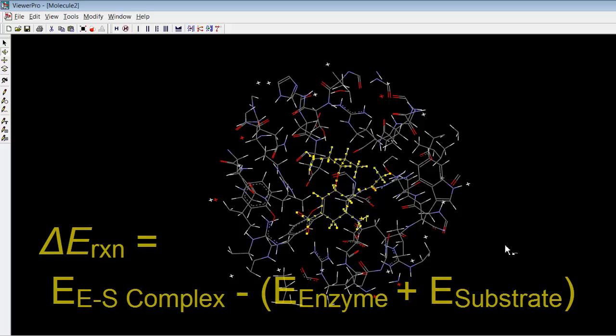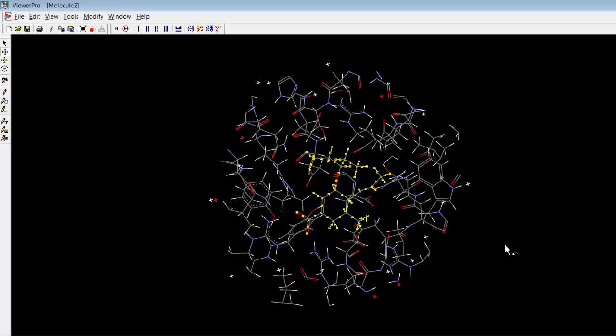You might ask, what is the purpose of all of this? Well, what we're trying to do here is to determine what delta E is. I will then, in a later video, show you how to change the structure of Tamiflu to be slightly different and then calculate a new delta E. The objective of this lab is to be able to design a new molecule that has a more negative delta E than the original Tamiflu and is therefore a potentially better medicine than the original Tamiflu itself. Hopefully that makes sense.